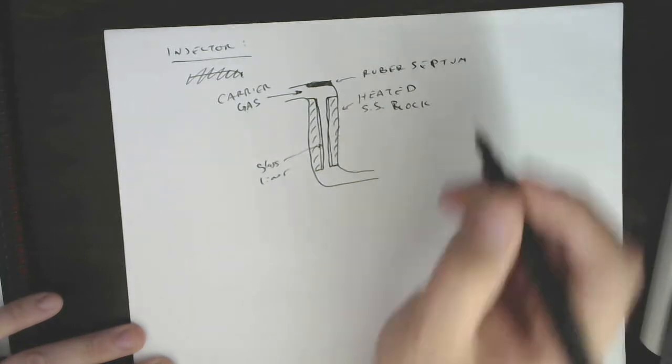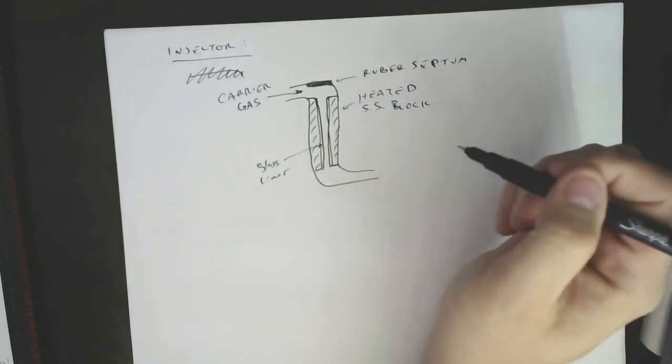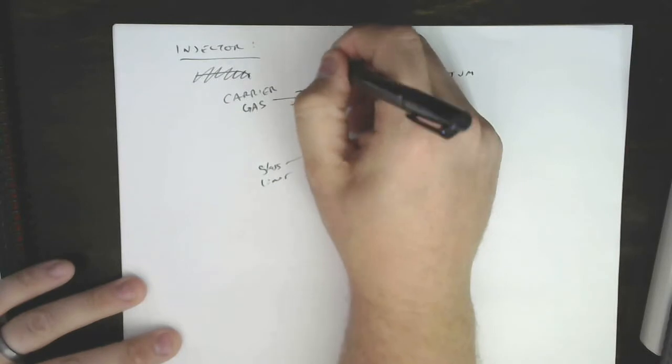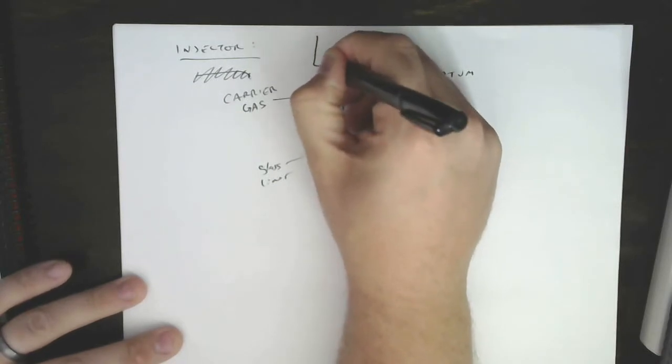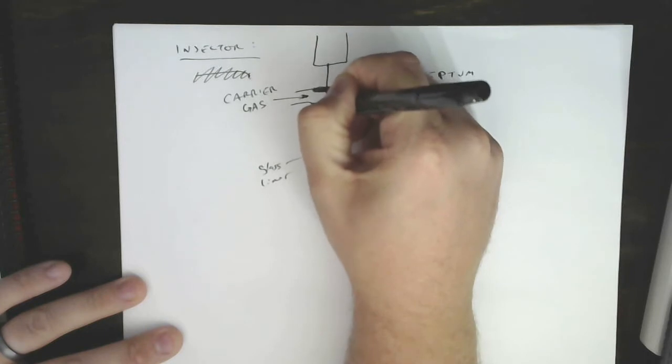So this is something that is sealed, and you can stab a needle through this thing and it'll remain sealed around the needle, right? So it's a rubber septum. Okay, carrier gas comes in here. Our sample, we said, was injected by syringe. So here's a syringe. There it is.